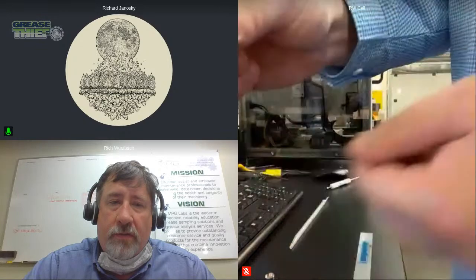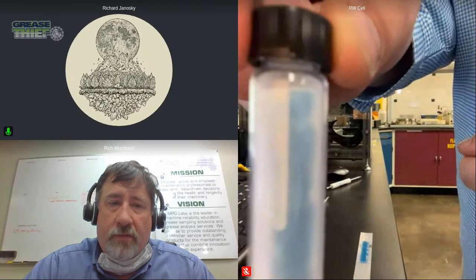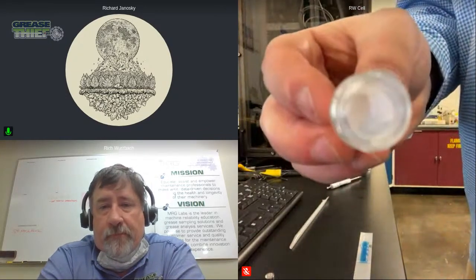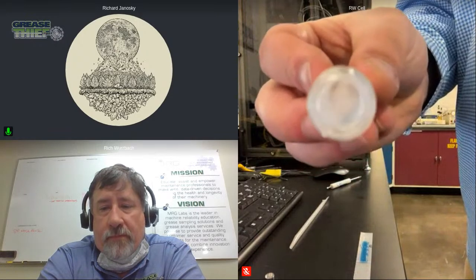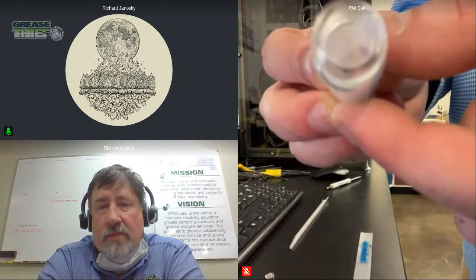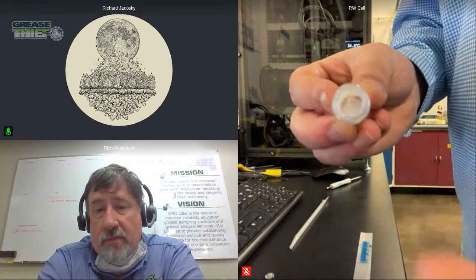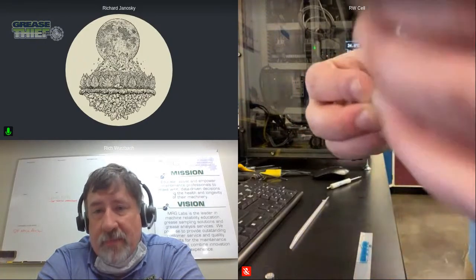All right, so there we see it falls down from outside of the neck. It's covered in the sand, so it's a little hard to see, but you can see the blue edge is under the black cap. Yeah. So then if I open this back up, you can see straight down into the bottom of the white sand, and you don't see the blue grease in the middle. So this is going to allow the probe to come straight from the top. It's going to go right into the vial, and then we're going to be able to run our tests, and then we'll be able to remove it. And this will prevent any of the grease from getting on the bottom of the probe and covering the sensor and then influencing the test.